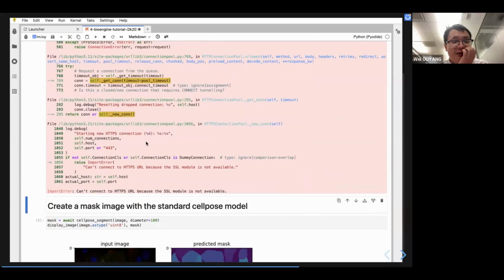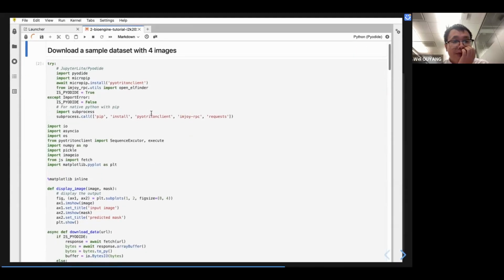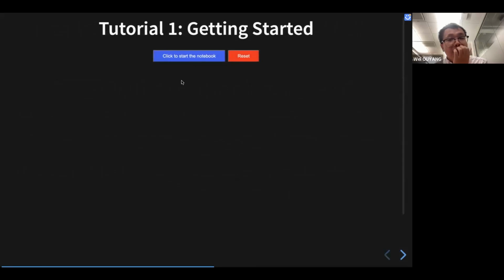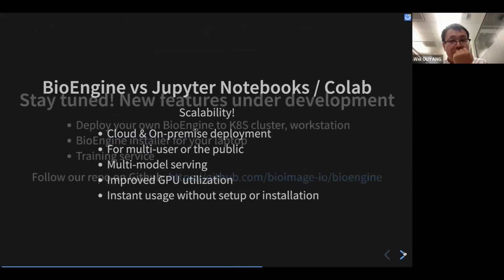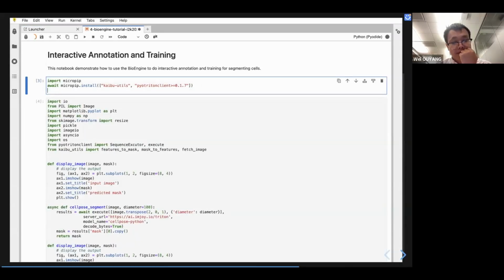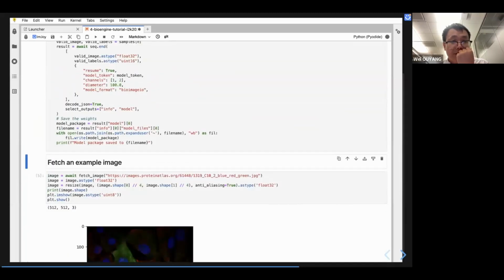Okay, there's something wrong with this. Sorry, I think I will need to patch it. There's a piece of code which I forgot to put inside. It's this one. Okay. So this is the model training I'm going to show you. This is only needed for this browser-based Python environment. This will be fixed. Otherwise, we'll need to skip.